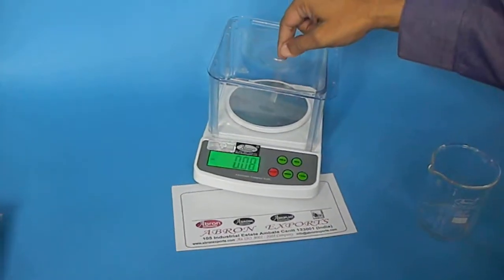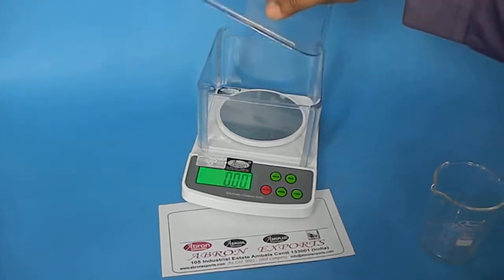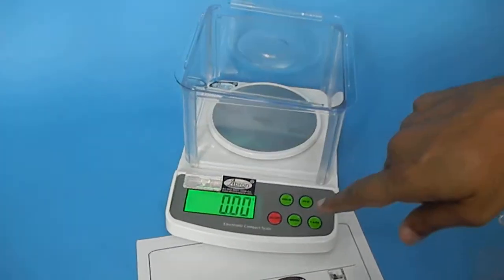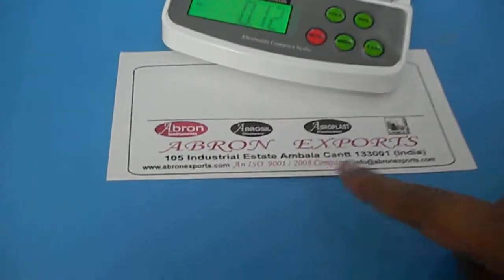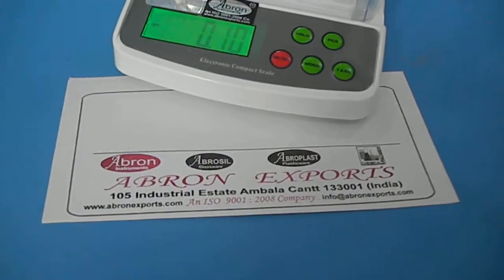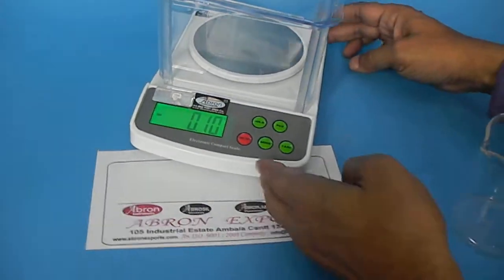The watch glass and other things can be used. Chemicals can be put in here. The top can be removed and it's very easy. This comes with cells as well as the power adapter shown here.